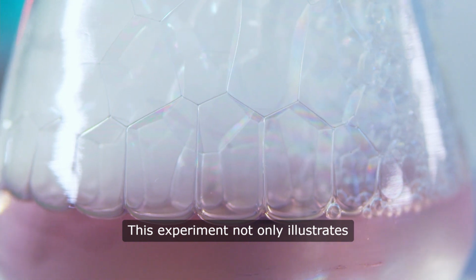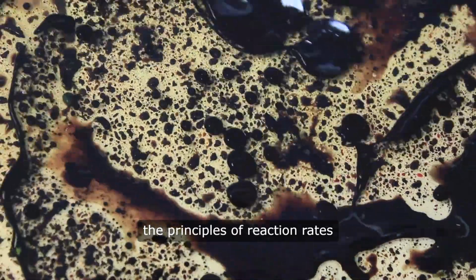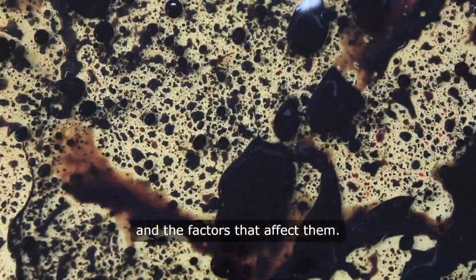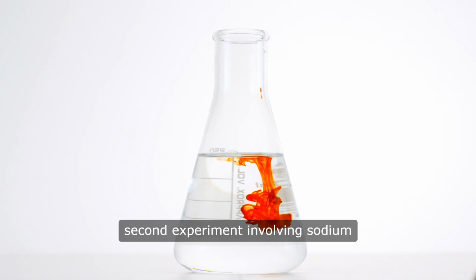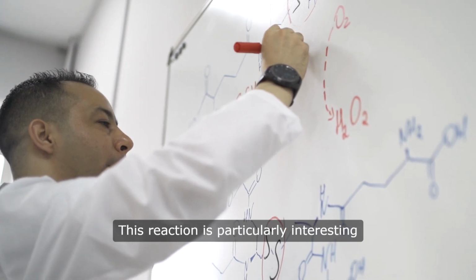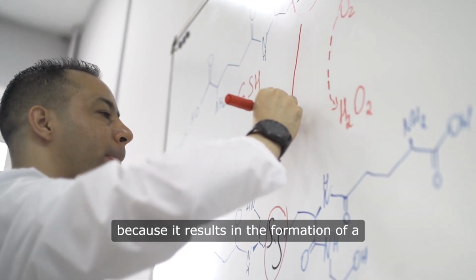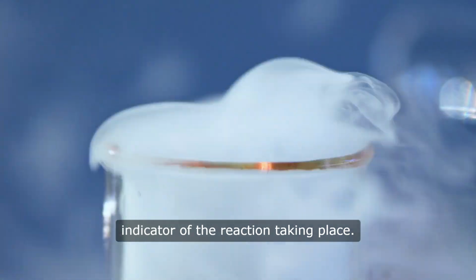This experiment not only illustrates the production of gas, but also emphasizes the principles of reaction rates and the factors that affect them. Now, let's shift our focus to the second experiment involving sodium thiosulfate and hydrochloric acid. This reaction is particularly interesting because it results in the formation of a cloudy precipitate, which serves as a visual indicator of the reaction taking place.